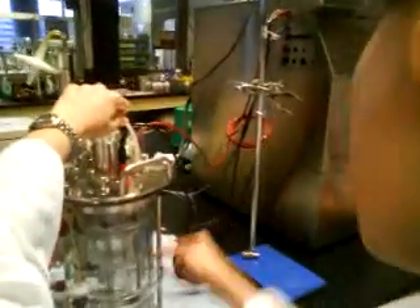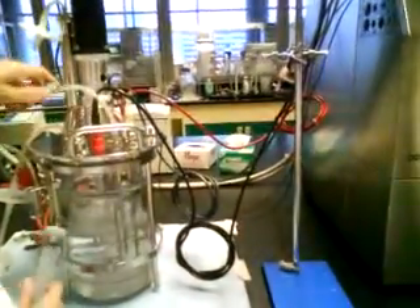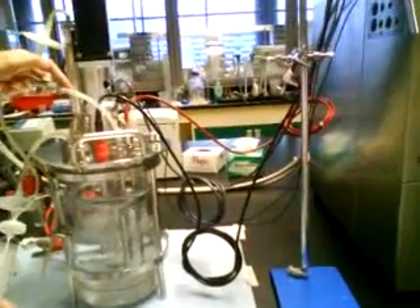If you loosen this clamp, this clamp is going to be all the way stuck into your reactor. So you loosen this one, and what you do is to create a pressure — you pull back your string, and then you see liquid moving up.